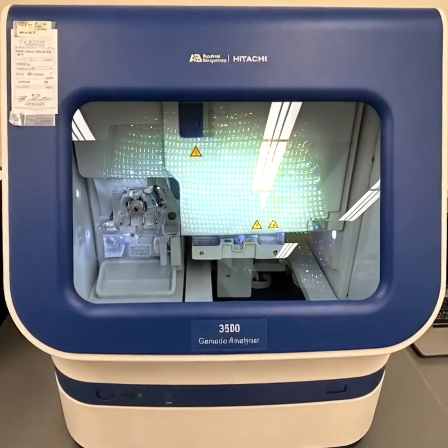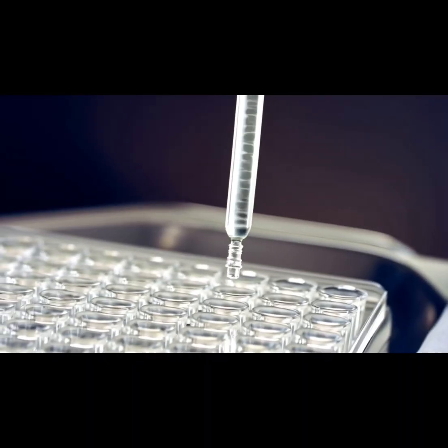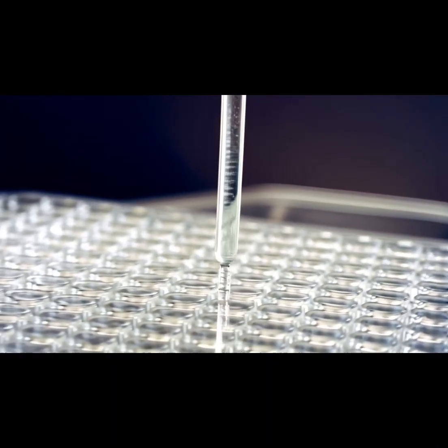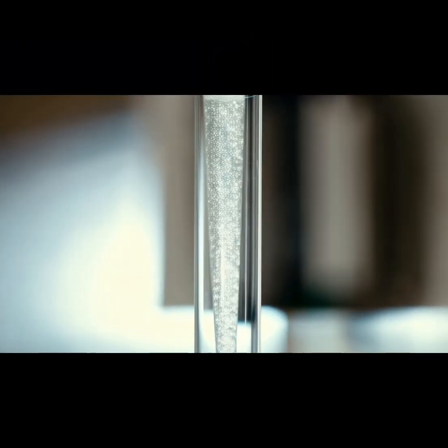the instrument. Let's watch a simulation of the DNA going through the capillary electrophoresis process now. We can see the wells are filled with our prepared samples. The capillary electrophoresis injects the DNA while applying a charge, which is an electrokinetic injection.